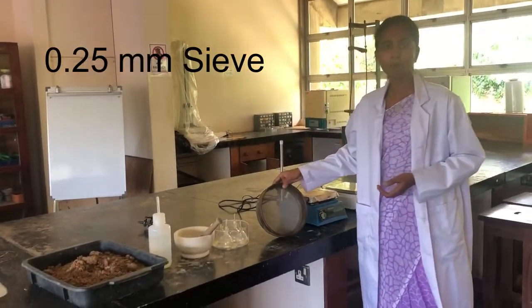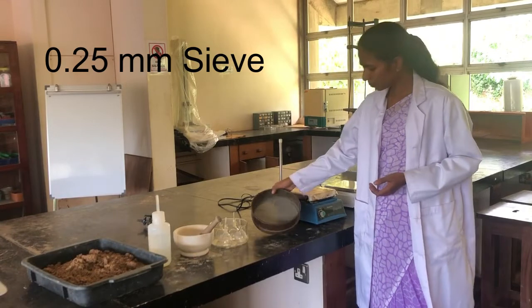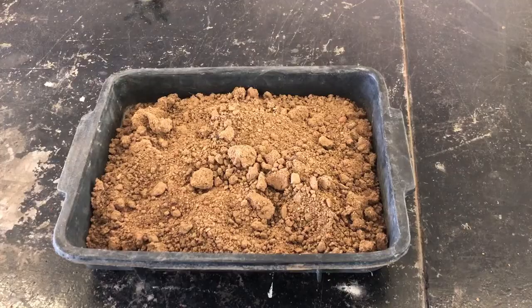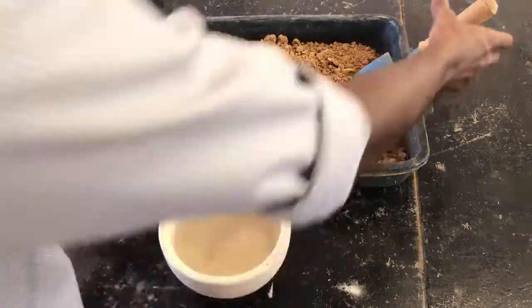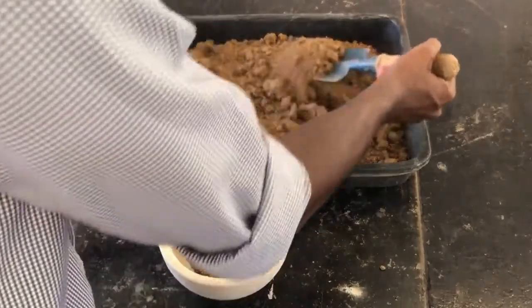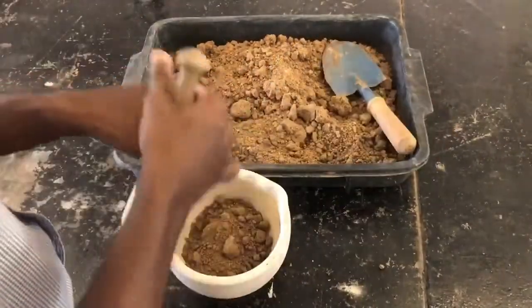This is a sieve with a mesh diameter of 0.25 mm, a hot plate and an analytical balance. Here we have an oven dried soil sample. If there are any foreign particles or debris, we have to remove them. After this, take the required amount of soil sample into a mortar and grind it very well.